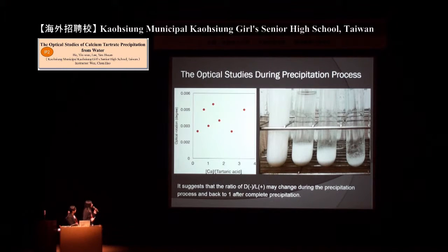And this is our initial experiment to see if we remove the precipitate, will the solution become optically inactive or not?